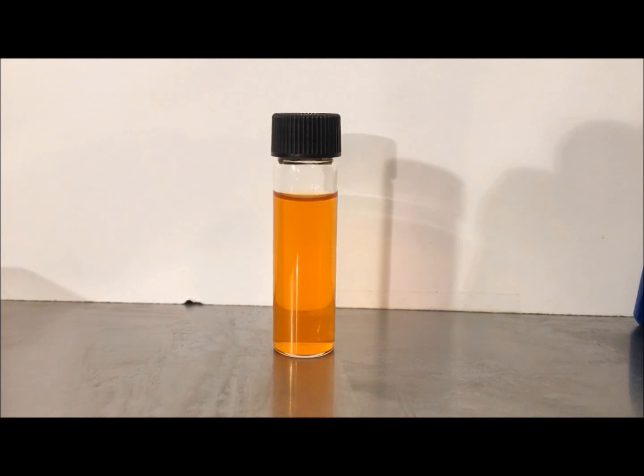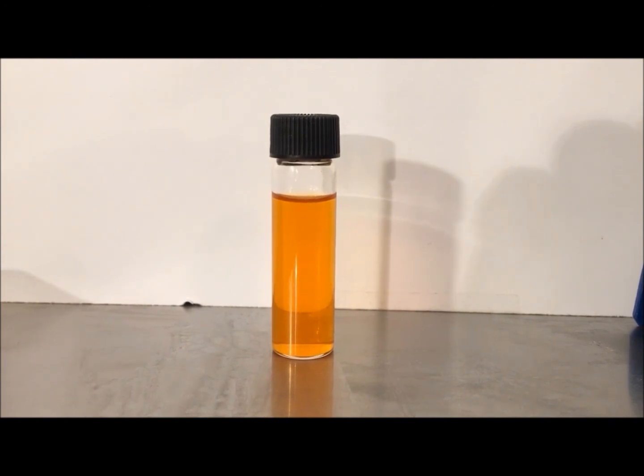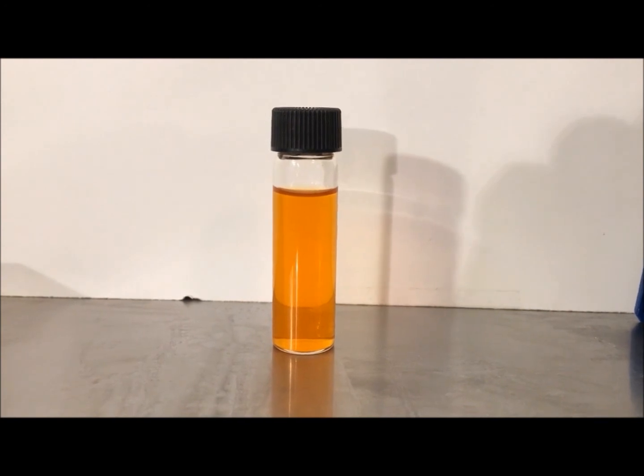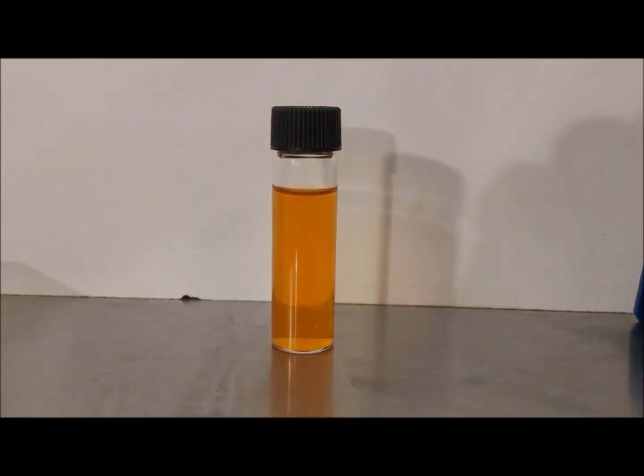Here's what the product should look like. It should be clear, not cloudy, and there should be no precipitate at the bottom. And it should stay this way indefinitely.